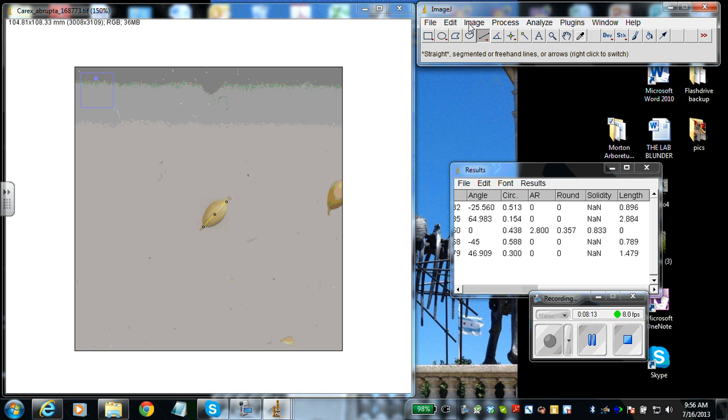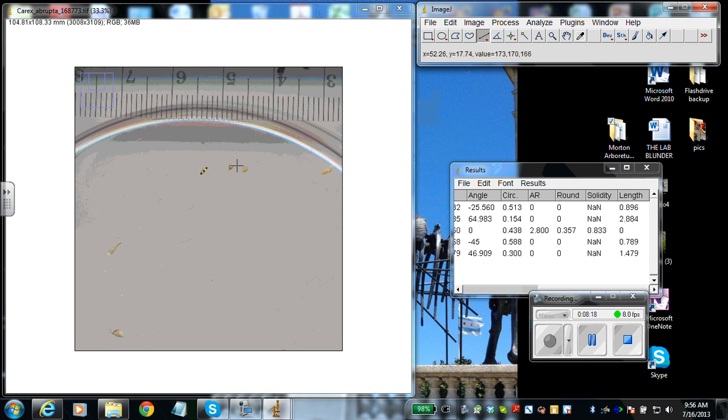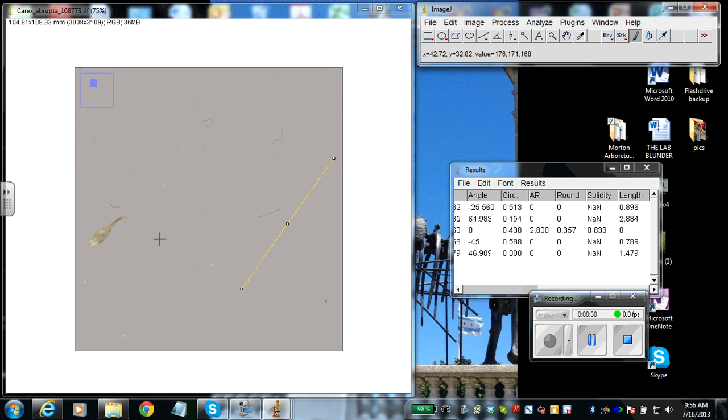We're now finally going to do the last piece, which is to count all of our perigynia. In order to count perigynia, I think the easiest thing you can do is mark them as you go around. So we're going to use a little paint tool. And as we go around the petri dish, I'm going to zoom back in. As you go around the petri dish, you're going to want to mark these. Right? Grab, move around. So we've got one, right? We look here, this one looks busted open. So maybe this one that's busted open is one of our achenes up here, right? We'll have to keep track of that. We can mark it right now.